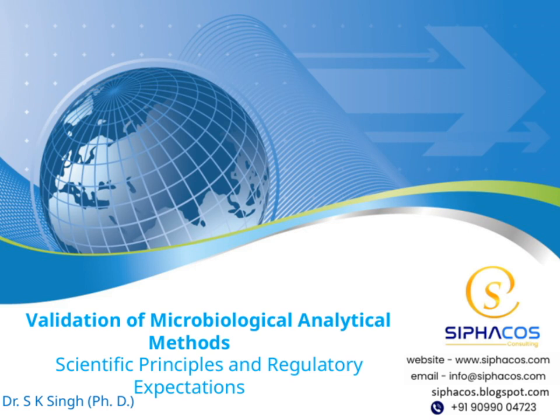Today's topic is validation of microbiological analytical methods. We'll be exploring both the scientific principles behind these methods and the regulatory expectations that guide us. Over the course of this session, we'll cover the key concepts, best practices, and regulatory considerations essential for effective validation. I look forward to sharing insights with you all. Let's get started.